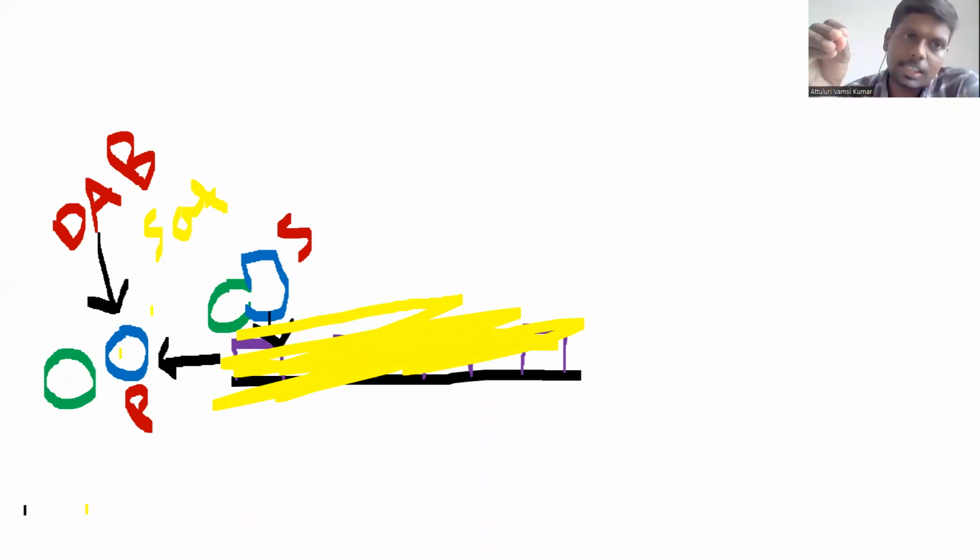Now I will discuss what the four principles and the four specific reactions are in enzyme histochemistry. All enzyme histochemistry techniques are based on these four reactions only. So now let us see what these four reactions and principles are in enzyme histochemistry.